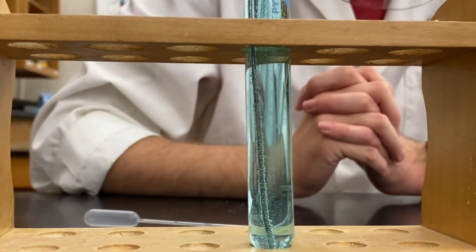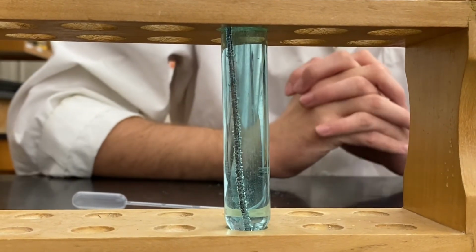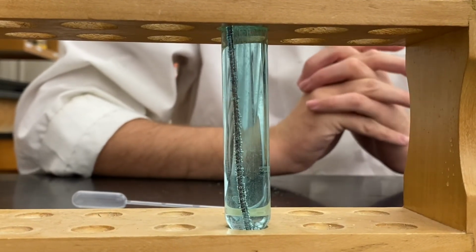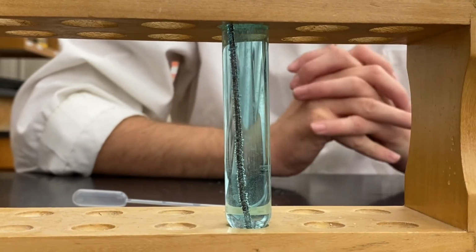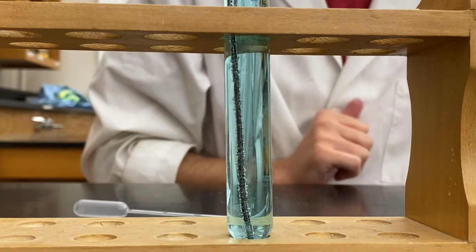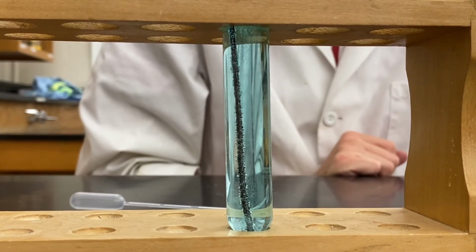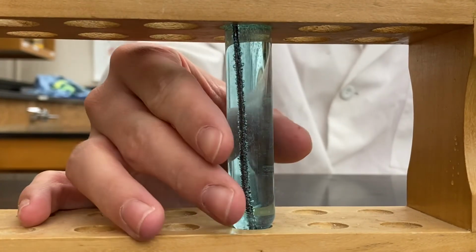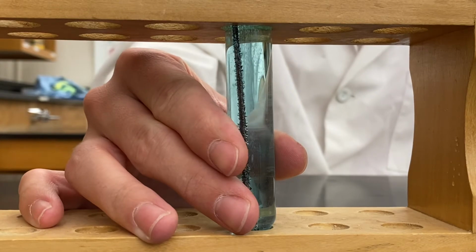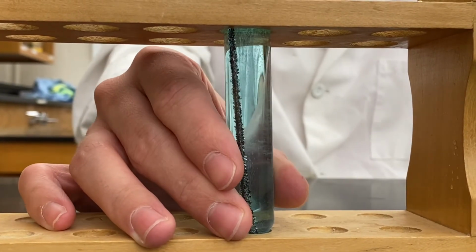Immediately you should be able to see some observations on that wire. Think about what's happening to the wire. Look at what's happening to the solution. The other thing I want to check here is as I'm touching the test tube, it's actually quite warm. So this reaction is giving off quite a bit of heat.